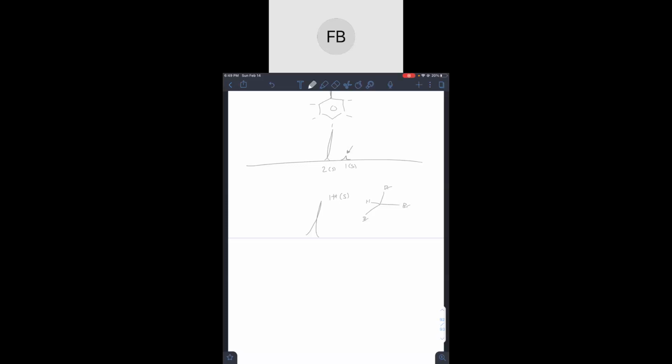Okay, so let's start. JD, you can start with Isabel, the first question on Isabel. So let me just put it out first. So this is a 2 triplet. I don't see why there's a C there. Oh, but yeah, so a 2 triplet.